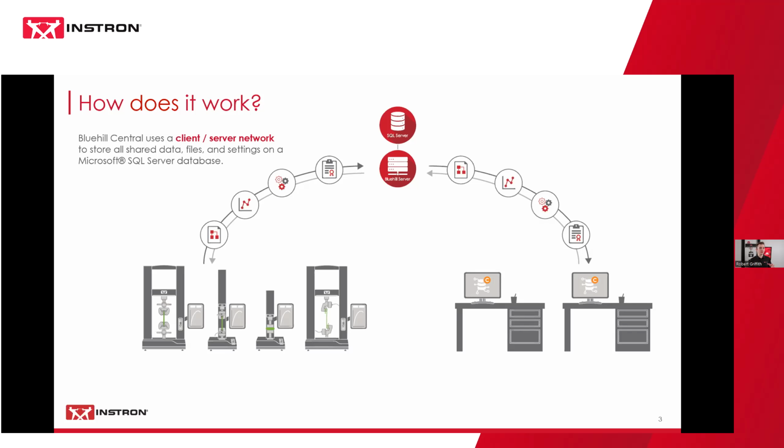That's about as nuts and bolts as I'm going to get into on the IT side of things of what's going on in the background, but you can think of it at a high level as a server that connects various components to share information. One of those first components is your Instron systems in your lab and those Bluehill Universal installations. Bluehill Universal is the software that runs your Instron system.